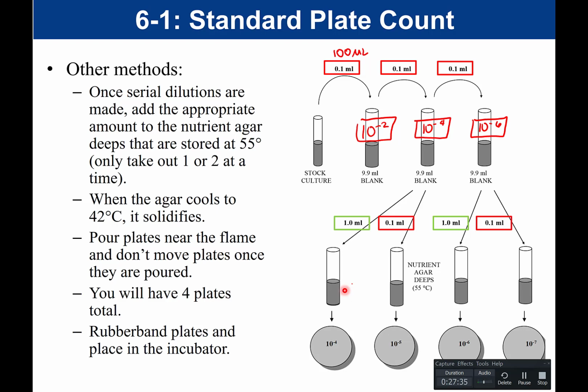So when we pour these plates, once we pour the agar into the plate, we do not want to move our plates. If we try to move our plate after that, it's going to slosh the agar around and it's going to contaminate your desk because it has bacteria in it.